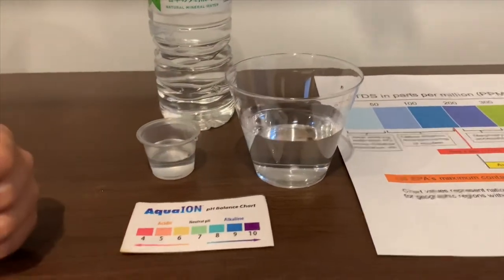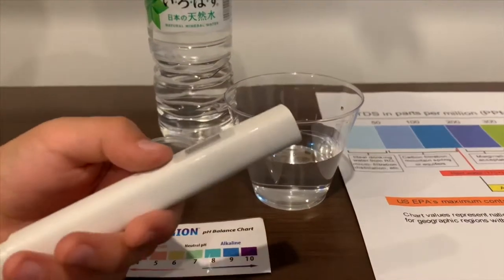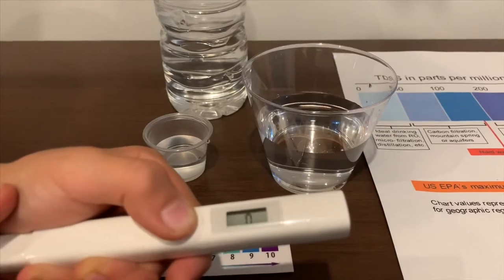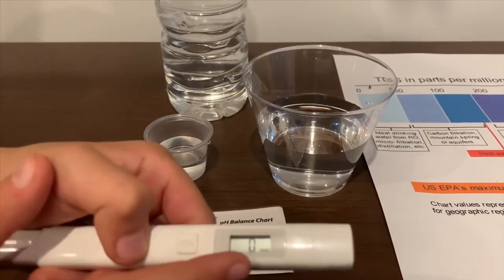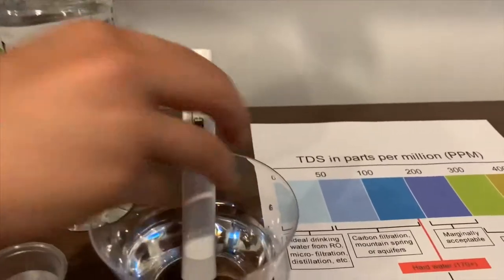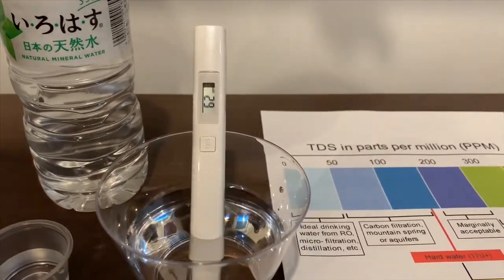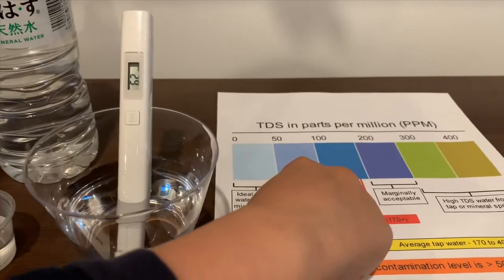First we're going to test the TDS level. If you want to buy this TDS tester, check the link down below. Turn on the TDS tester, make sure it says zero, and put it in — 62. That is okay to drink.